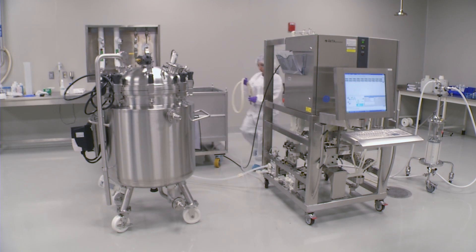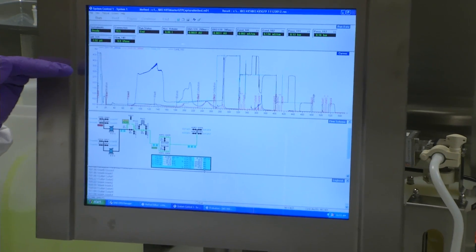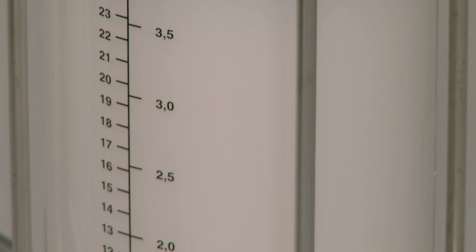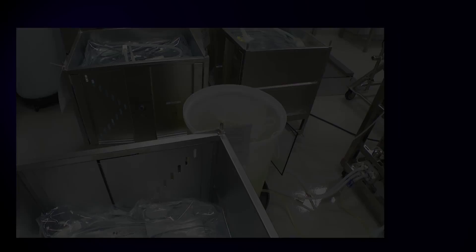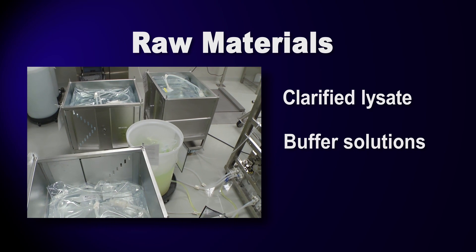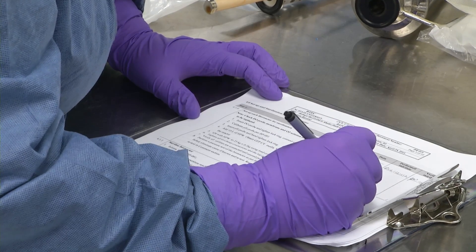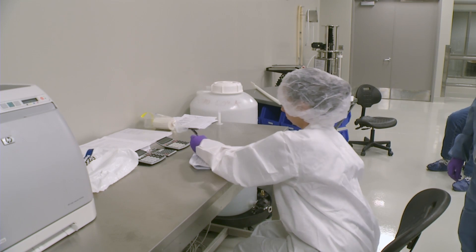It's time to gather everything we'll need for the purification process and ensure that the area and equipment are ready to go. The chromatography skid and TFF system are checked for proper operation. Process hoses are attached and examined for leaks. We verify that we are using the correct column resin and that the resin is properly packed. The column is filled with a storage buffer and the product path is checked for trapped air and purged if necessary. The purification process is managed through the use of a batch record — there is a separate batch record for each processing operation, and these documents lead the operator through the process step by step, with each step requiring a sign-off and separate verification by a second operator.